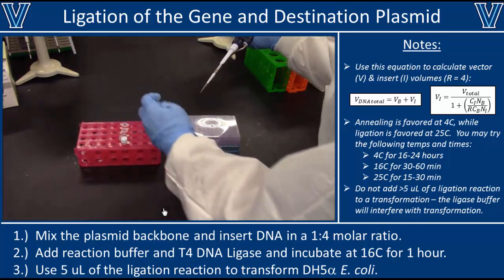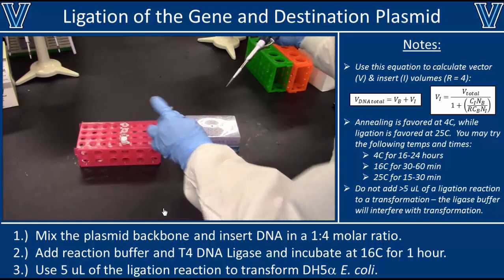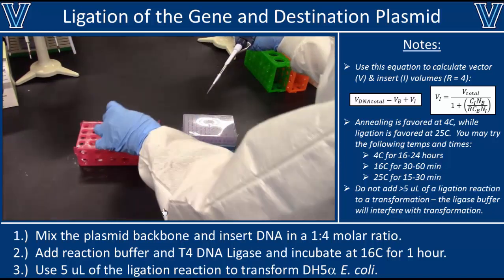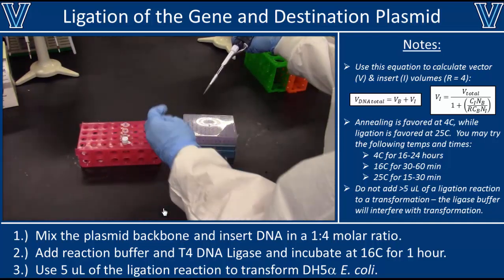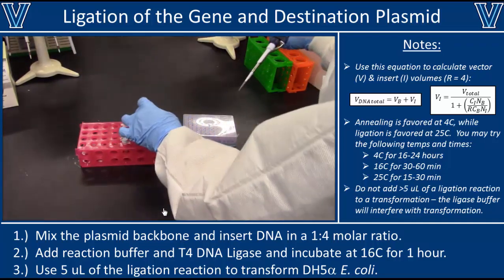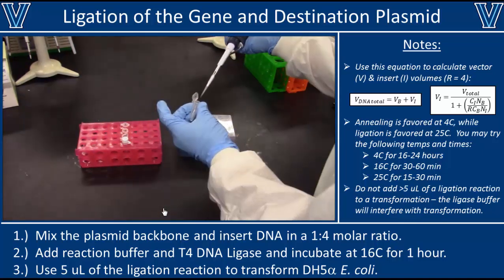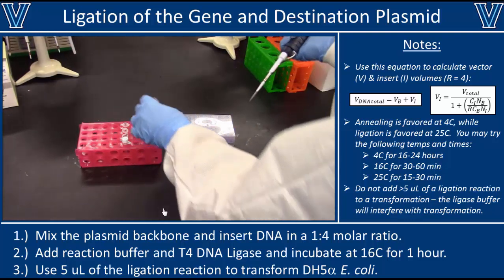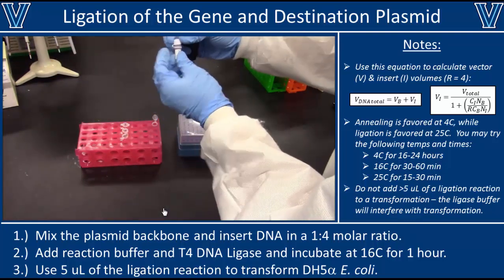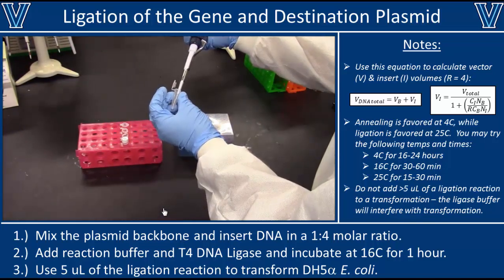Begin by mixing your insert and backbone DNA samples — for example, 4.8 µL of insert and 11.2 µL of backbone DNA. Next, add 2 µL of the T4 ligase enzyme buffer. Finally, add 2 µL of the enzyme itself. Once you're finished with the enzyme and buffer, put them back in the freezer as soon as possible.